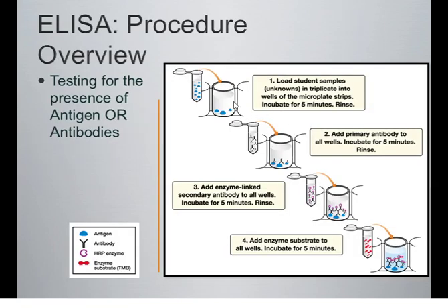So the first step is you take your sample and you put it into the little well, and any proteins in that sample will actually bind to the bottom of the plastic, okay? Now, before you go into the next step, and this is a really key point, especially for the exam, I'm going to test you on this on exam 4, before you do the next stage of this ELISA, you have to coat the remaining surface of the plastic with some other protein.